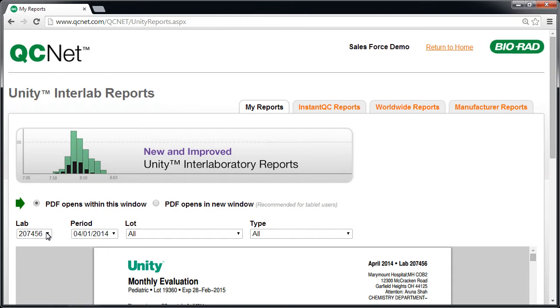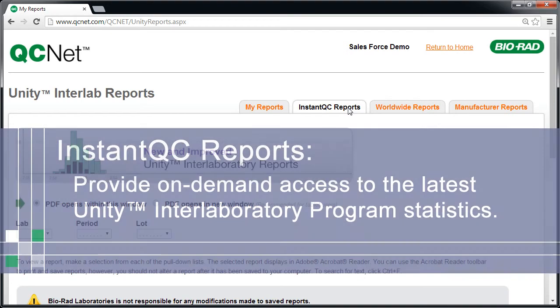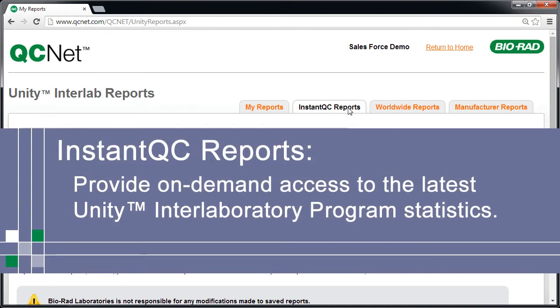Next, we'll select the Instant QC Reports tab. Instant QC Reports provide on-demand access to the latest Unity Interlaboratory program statistics.